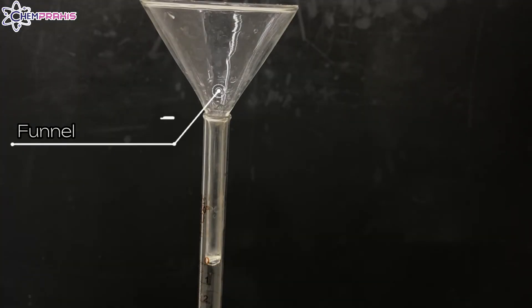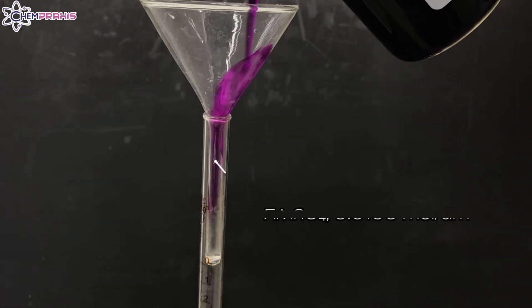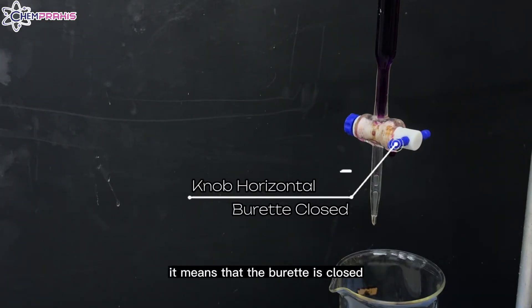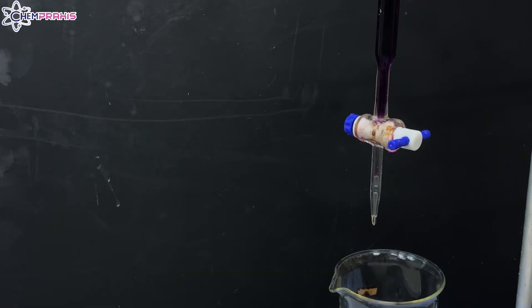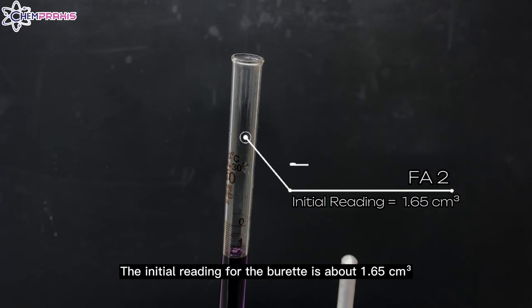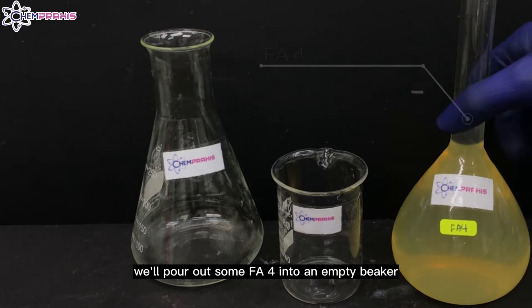Now we can start to prepare for a titration. First, we'll fill the burette with FA2. With the knob on the burette horizontal, it means the burette is closed. When you fill in your burette, it's quite likely that some air bubbles will remain at the bottom. You can open the burette and let the air bubbles flow out by turning the knob to make it vertical. The initial reading for the burette is about 1.65 cm³. After filling up our burette, we'll pipette 25 cm³ of FA4 into a conical flask. Before that, we'll pour out some FA4 into an empty beaker.